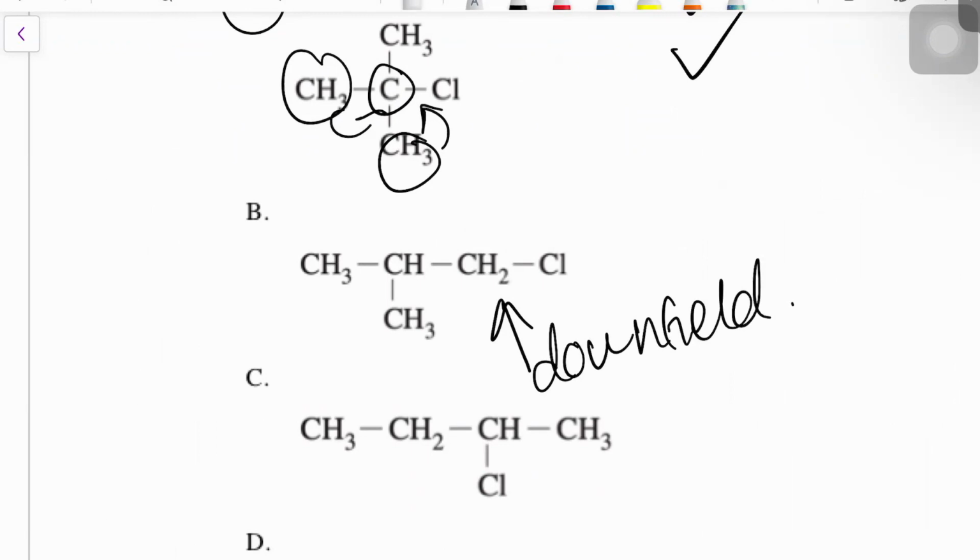The second thing to watch out for is that the molecule is not symmetrical, the carbons are in a line. Normally, by the way, when the carbons are in a line, it's not going to show one signal because they're a certain distance away from something. They're not equidistant. So this hydrogen's going to show one peak. This hydrogen's going to show another peak.